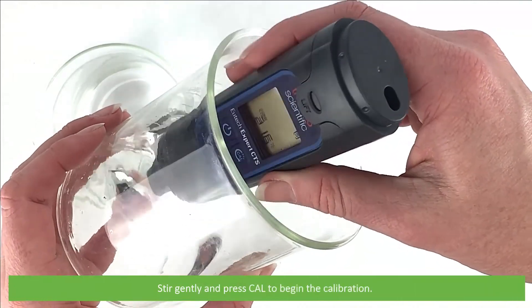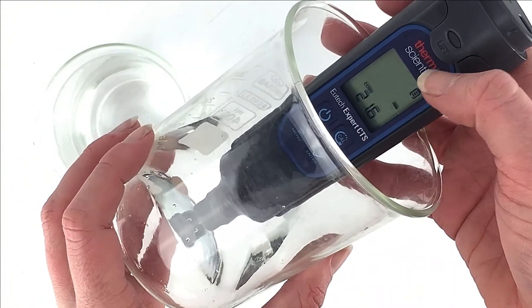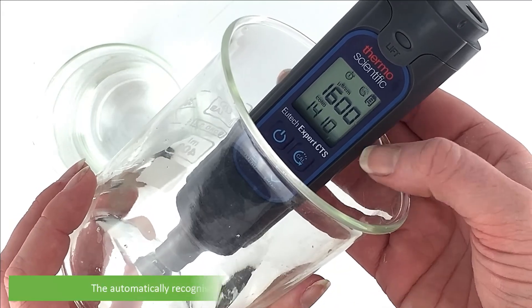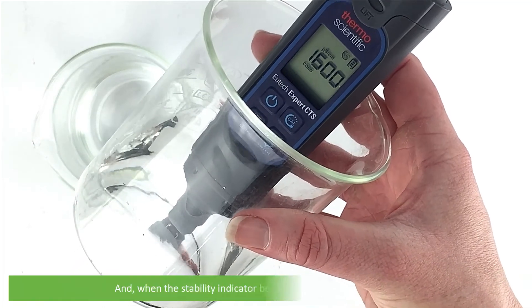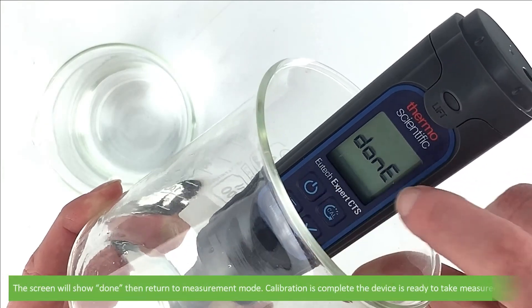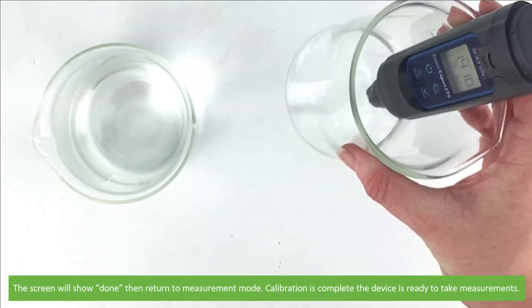To calibrate, dip the sensor in at least 30 millimetres of calibration standard, stir gently and press Cal to begin the calibration. The display will show CAL followed by the default value. The automatically recognized value will appear on the bottom line of the display, and when the stability indicator turns to a tick, press Enter to accept. The screen will show Done and then return to measurement mode. Calibration is complete and the device is ready to take accurate measurements.